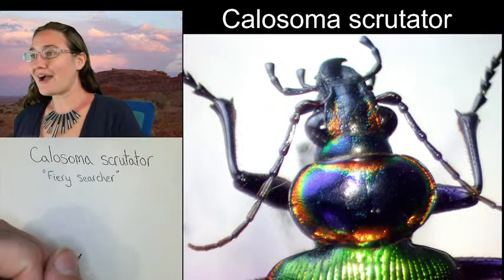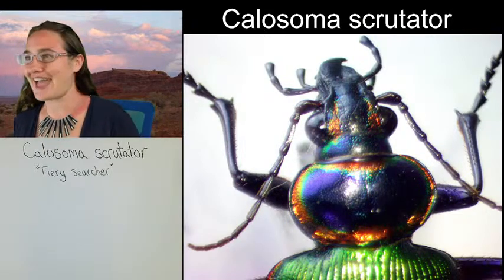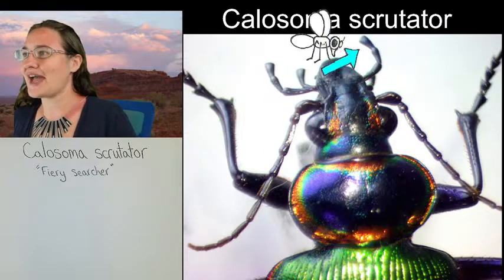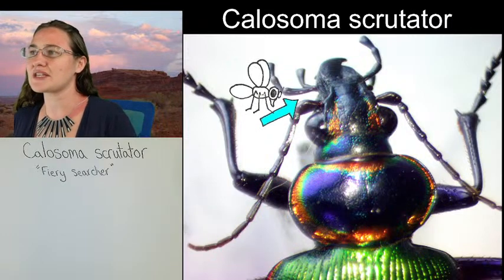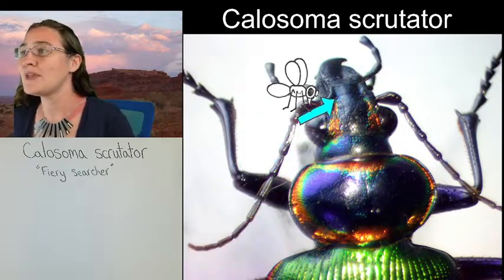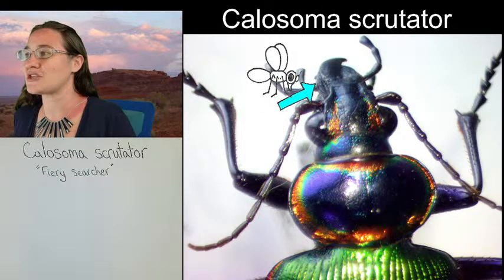Alright, so I think the individual segments on this body are pretty easy to look at. So we're going to start up here at our head. We've got some compound eyes. We have what we would consider filiform antennae. These are long, straight antennae. These right here you can see up off of the front, those are going to be our mandibles.